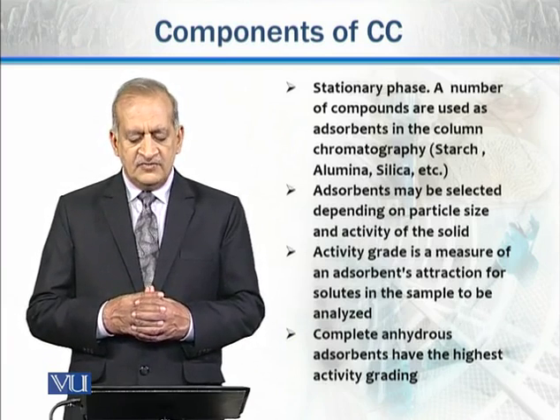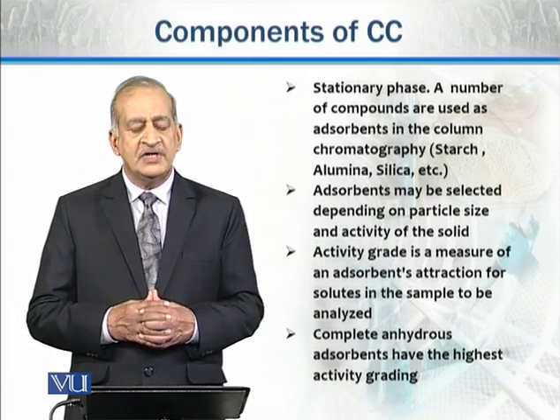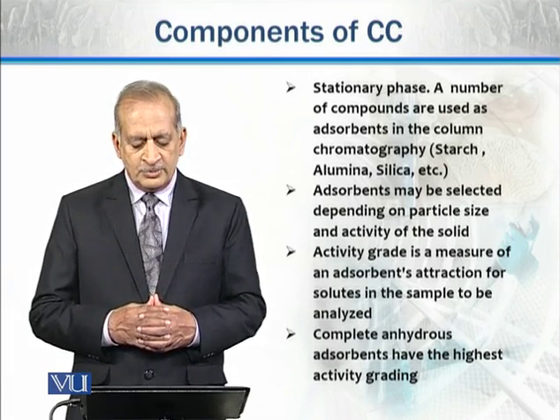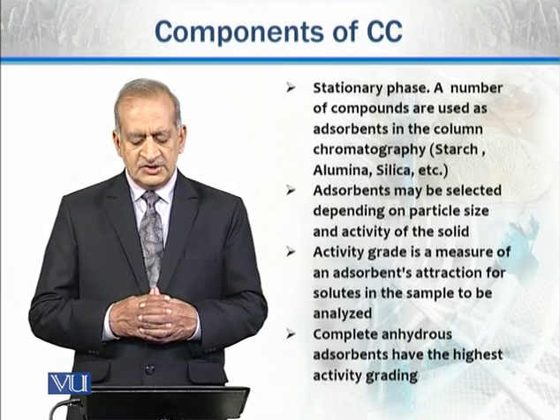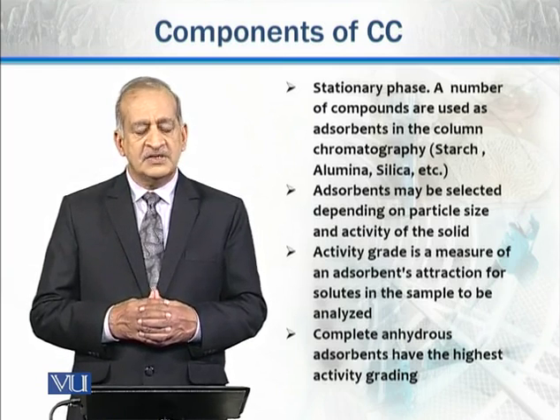Adsorbents may be selected depending on the particle size and activity of the solid. Now, activity grade is a measure of an adsorbent's attraction for solutes in the sample to be analyzed. Generally, completely anhydrous adsorbents have the highest activity grading.